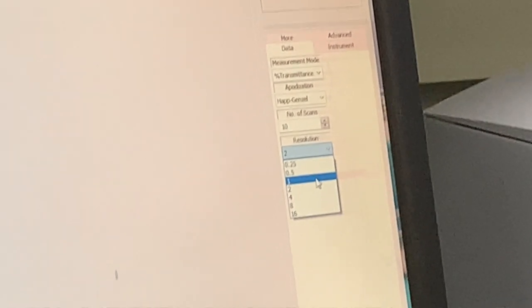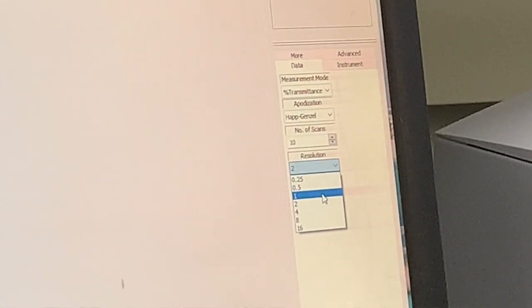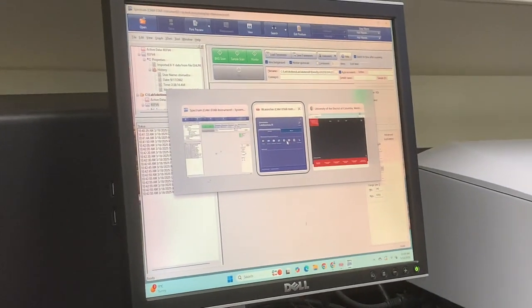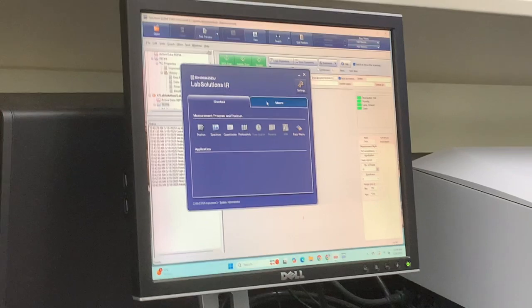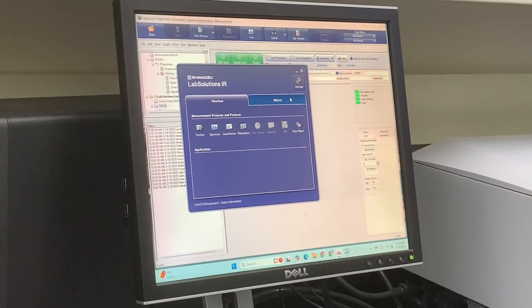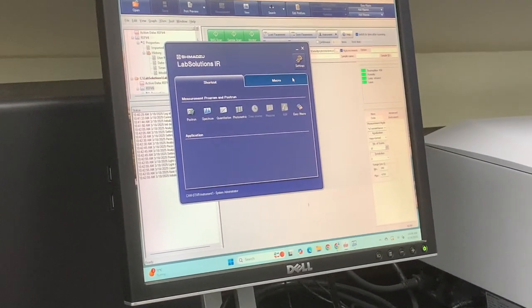What's the unit over here? Press F1. Okay, never mind, the contextual help is only on the GC software. I actually don't know the value of the resolution. I'm not sure if it might be dimensionless, or maybe nanometers like a slit width.